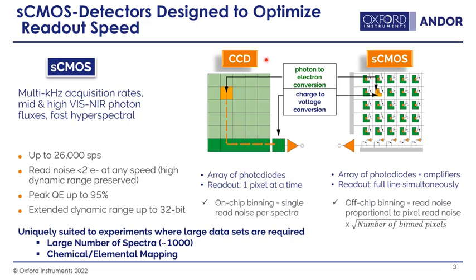Over here, I'm showing our conventional CCD, where a photoelectron is generated in a pixel and then travels down the other pixels to the readout register, where it's turned into a voltage. But this means that you can only read out one pixel at a time. In a CMOS sensor, each photodiode has its own readout circuitry built in, so you can read out whole lines simultaneously at a time, and this allows for much faster spectral readout rates on the order of thousands of spectra per second.